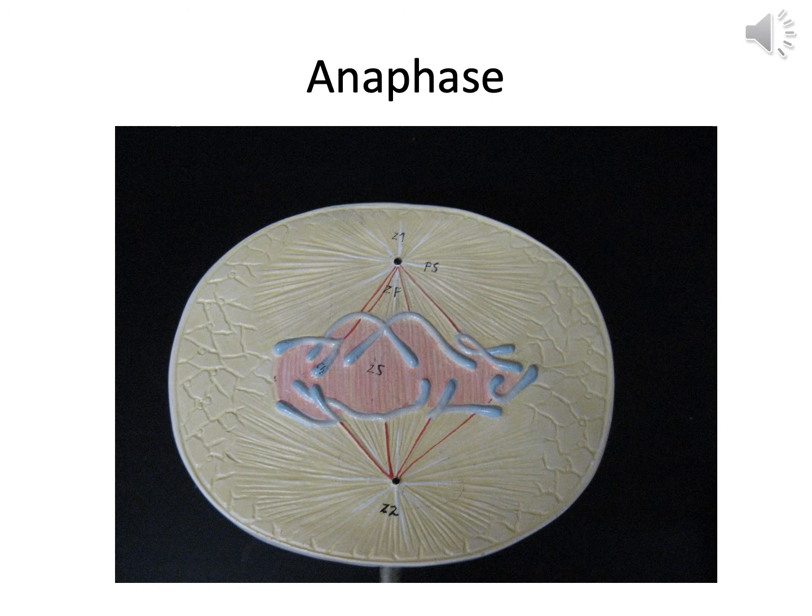During anaphase, the big thing is the daughter chromosomes move apart by the aid of spindle fibers to the opposite poles of the cell. A is for anaphase, A is for apart. On the picture here, you can kind of see a little bit of pink in between those blue-gray chromosomes. If you see any kind of space between the chromosomes, we're going to go ahead and call that anaphase. But basically, those centrioles and spindle fibers are doing their jobs and pulling the chromosomes apart to the top and to the bottom. Yes, the centromeres split and separate, and science majors talk about exactly how many chromosomes you've got in any given phase.